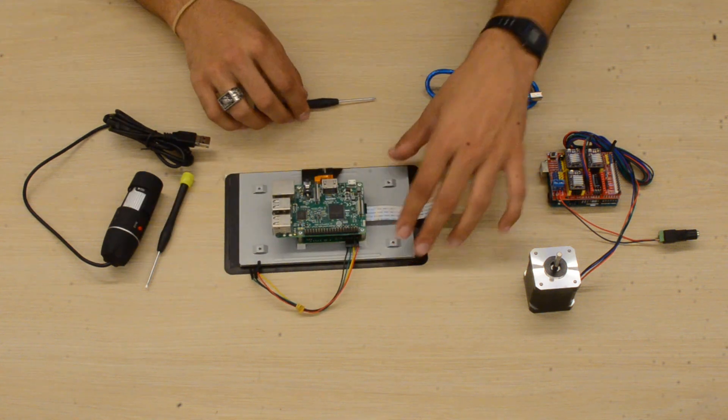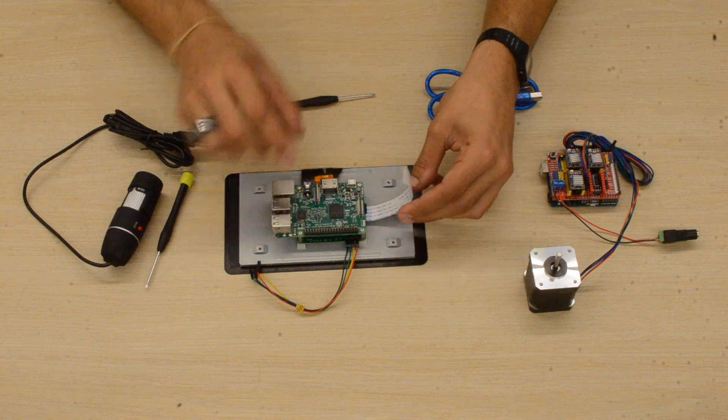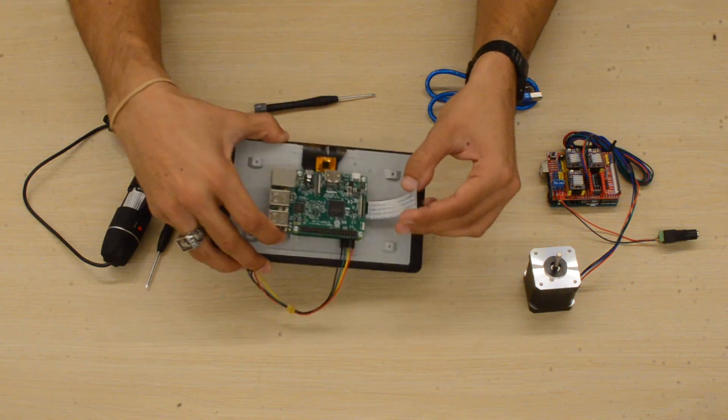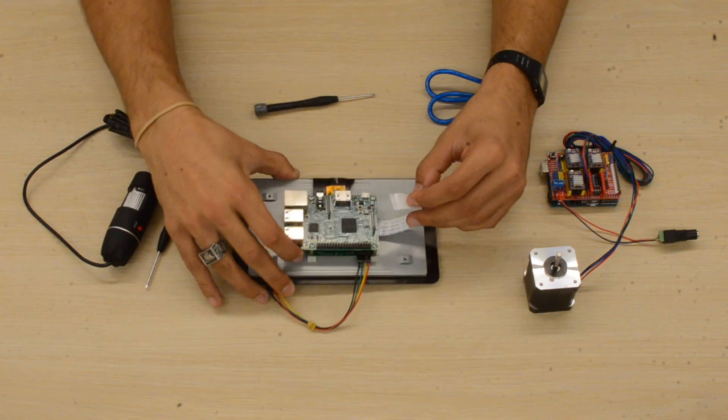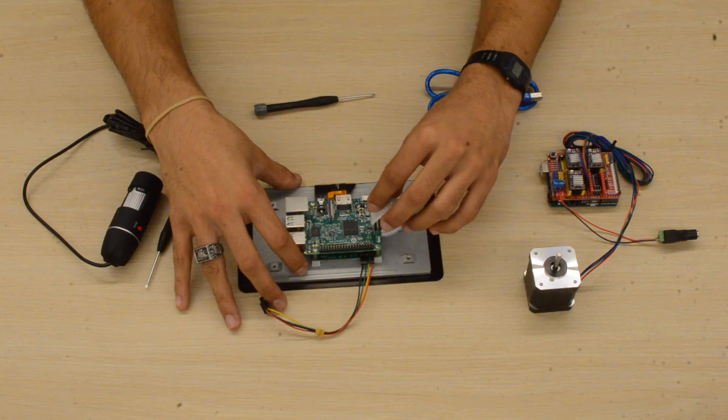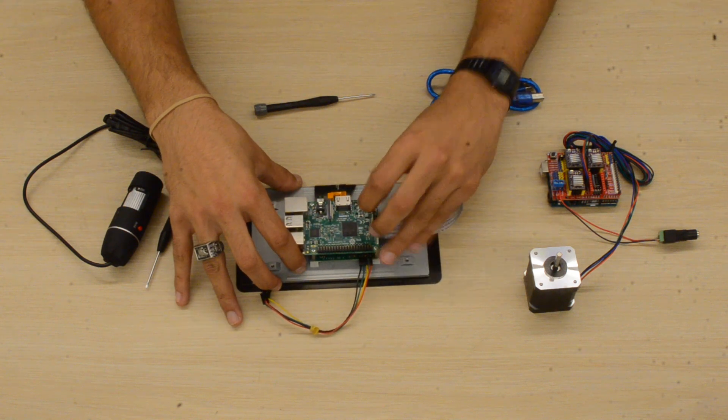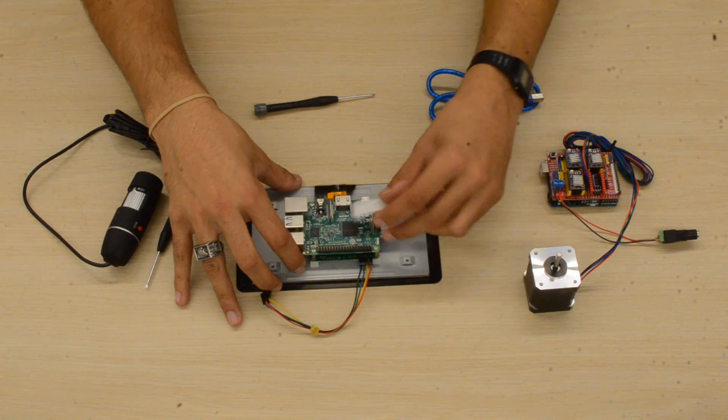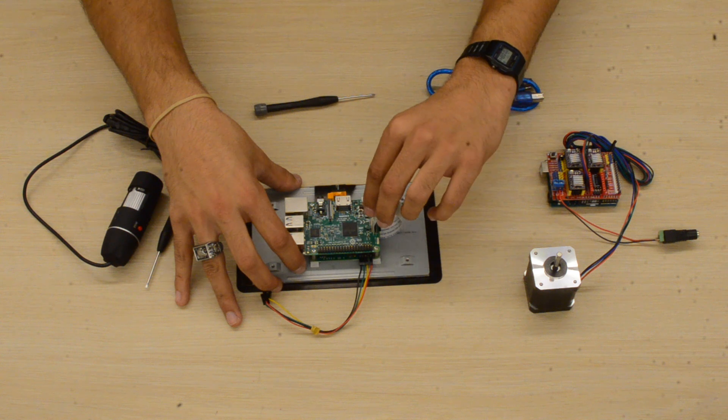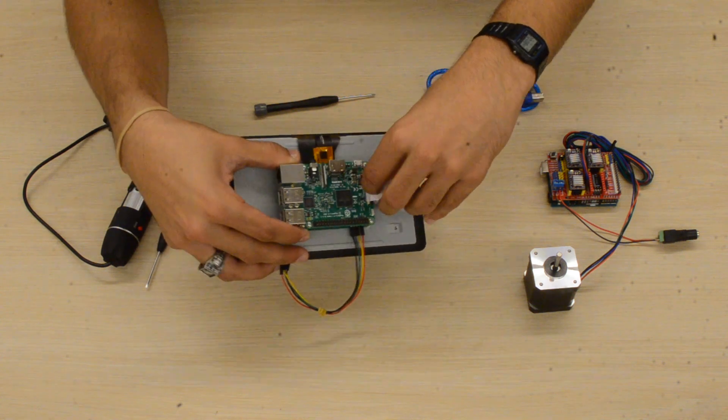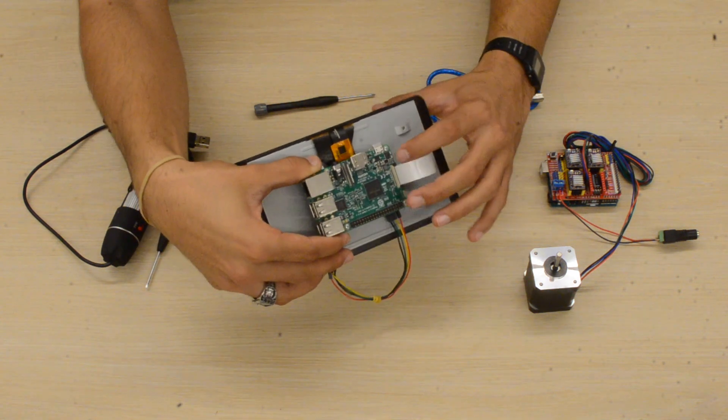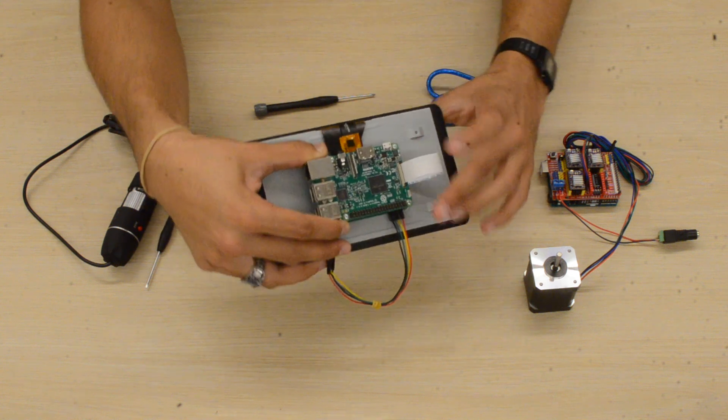Okay, next we'll take the ribbon cable and connect it to the Raspberry Pi. First, make sure that the tabs are pulled out, and then we'll just slide it right in. The shiny side should be facing the appropriate way. And then we just press down on the tabs to lock it in place.